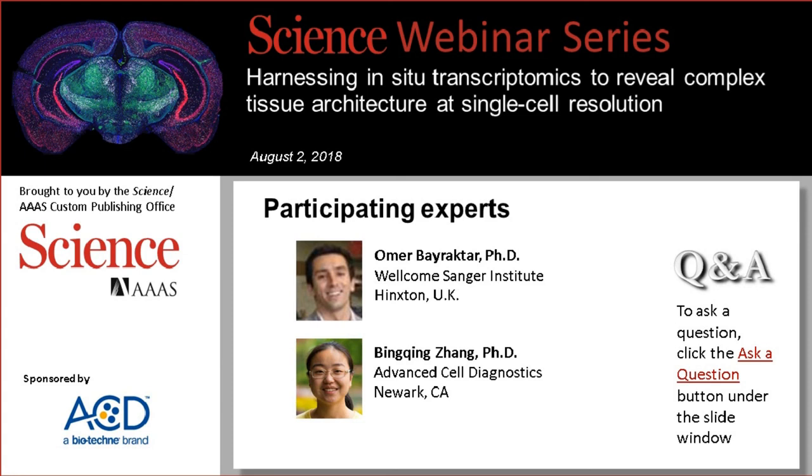So in the future, I think one of our goals will be improving the multiplexing of LastMap to be able to assay more than 4 genes. While I can see similar developments happening in StarMap in terms of improving their imaging speed.